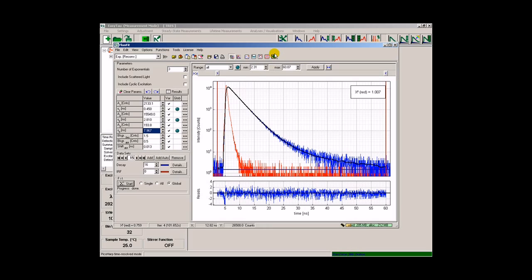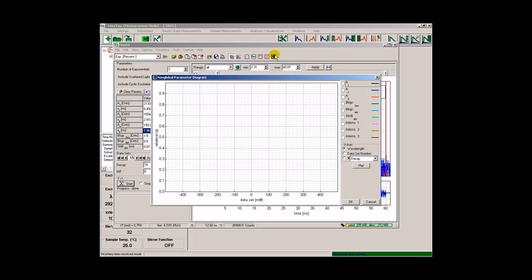Finally, we can also plot the evolution of selected non-global parameters as they change with the wavelength. Here we select the intensities of the three exponentials.